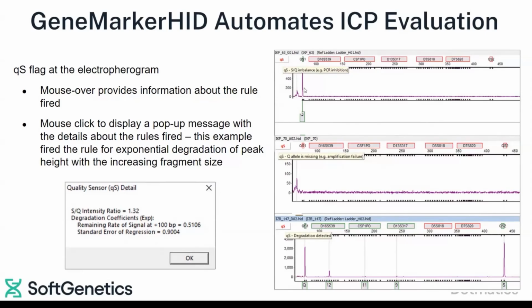You see that there's a nice tall peak here at the low molecular weight in the sample. There are no sample peaks, no amplicons, but there's also not that high molecular weight internal control probe. And so this points towards PCR inhibition.